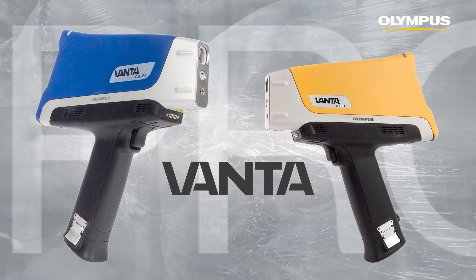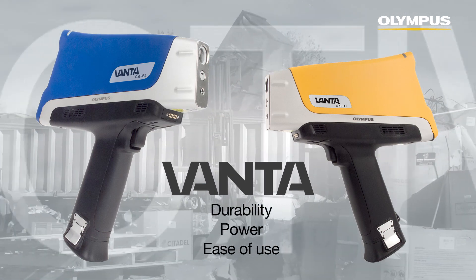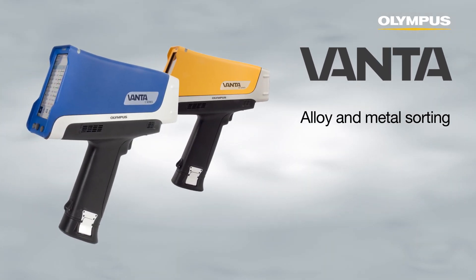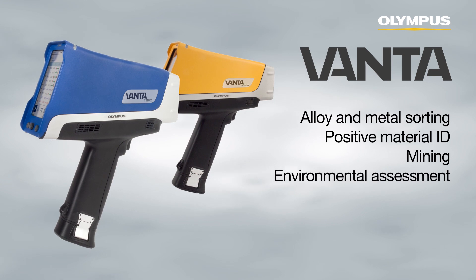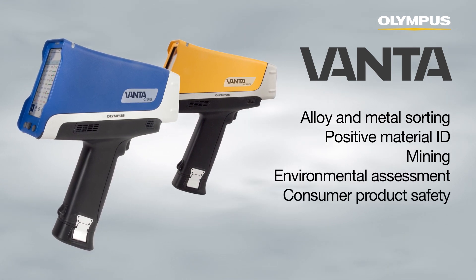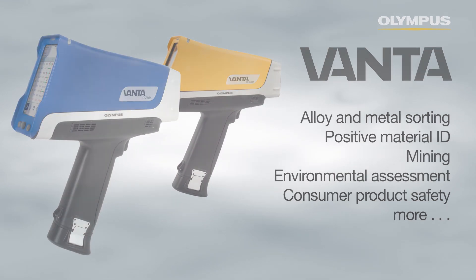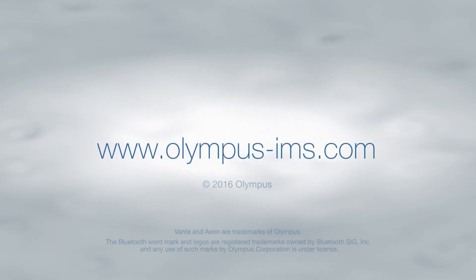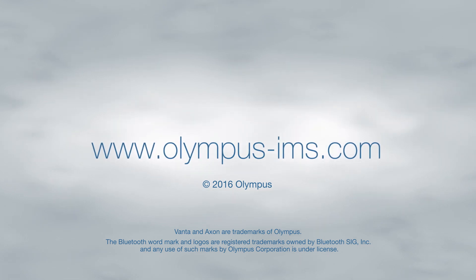Vanta analyzers combine durability, power, and ease of use for excellence in a variety of applications including alloy and metal sorting, positive material identification, mining, environmental assessment, consumer product safety, and more. To learn more about Vanta, contact your Olympus representative for a demonstration or visit www.olympus-ims.com.